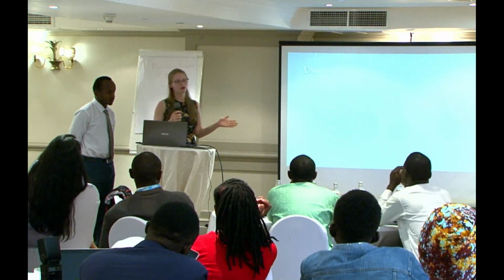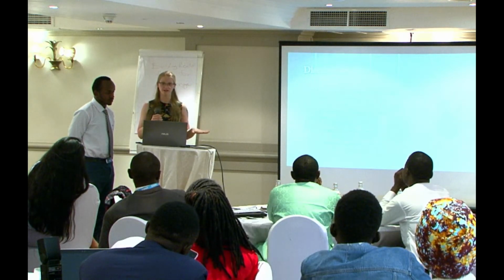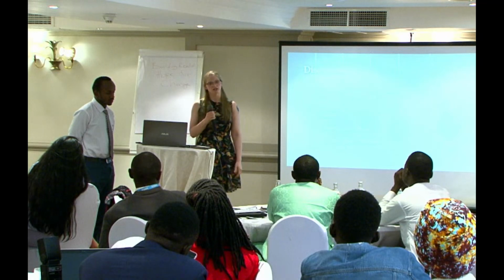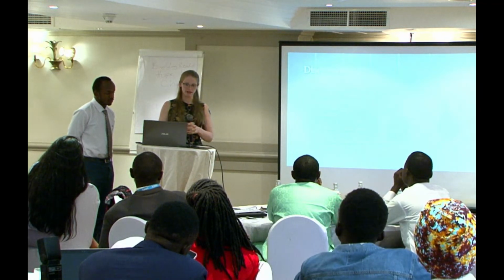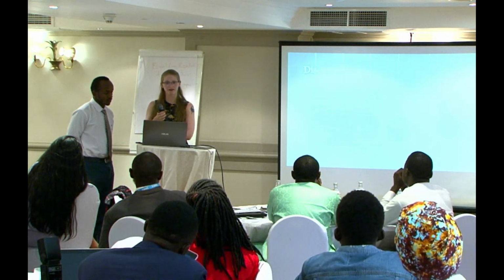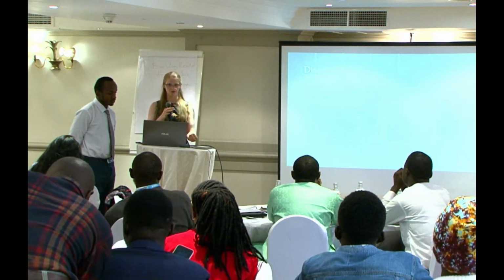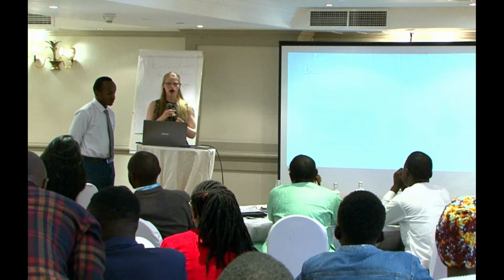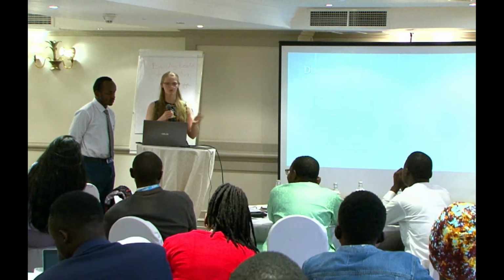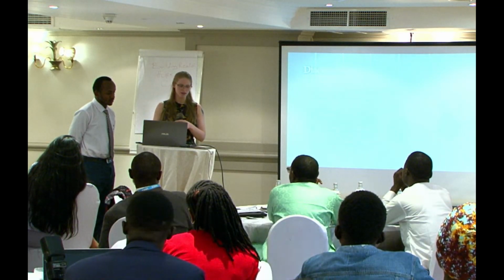Okay. In conclusion, Withania somnifera's bioactives are really different from its endophytes. And so endophytes were not producing them. Each tissue and organism differed by polarity. Contamination is pretty likely, like we saw in the LC. And this is even more likely because we did not have standards and we did not have replicates. Thus, we need the replication to make sure that my nice graph is true. But many compounds did still match the molecular library.